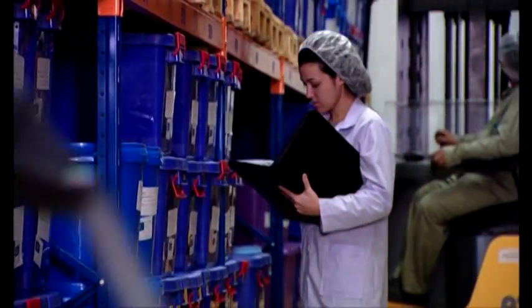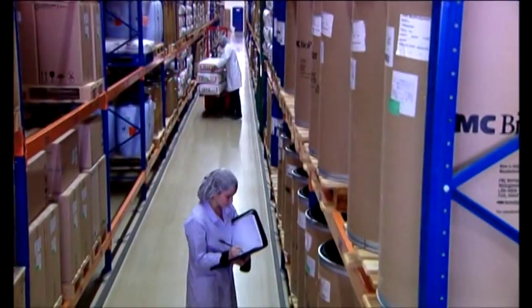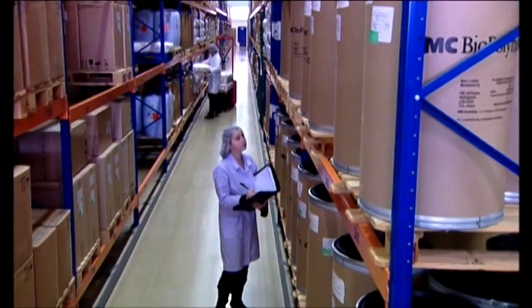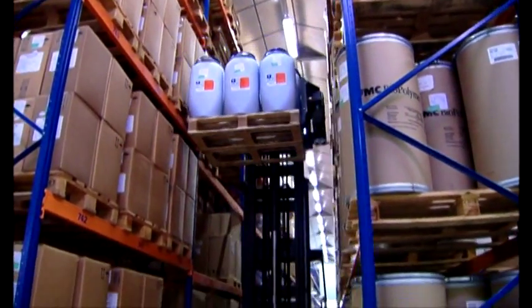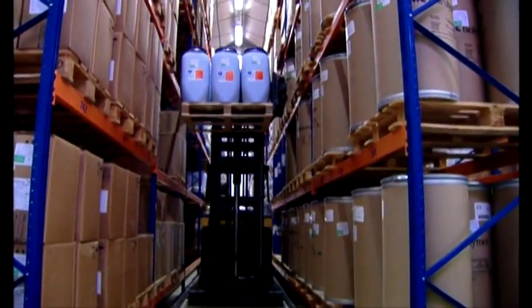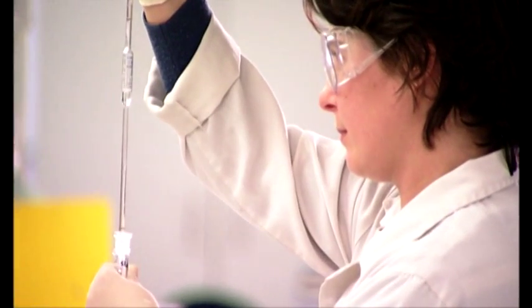Material entering the separate warehouses are identified and quarantined until they have been released from quality control. Only then are they stored on the allocated warehouse racks awaiting production request.